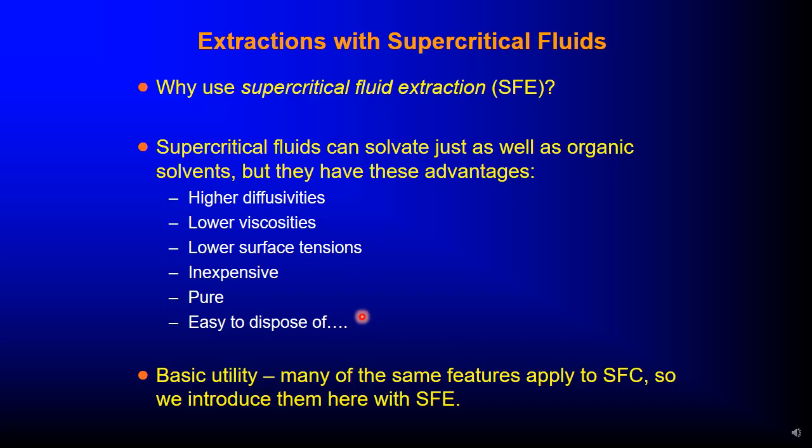Many of the same features apply to supercritical fluid chromatography, so we introduce them here with supercritical fluid extraction.